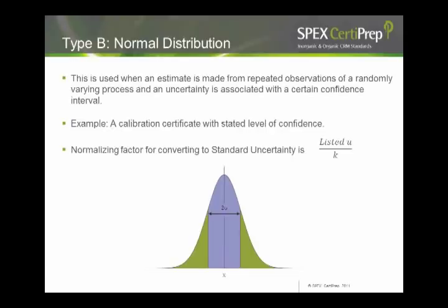Do you dilute the reference material? You write down the process. What is the sample dilution? What are all the environmental conditions? Is there any uncertainty associated with the equipment? You have to ponder over all these details and write them down in order to calculate the uncertainty.